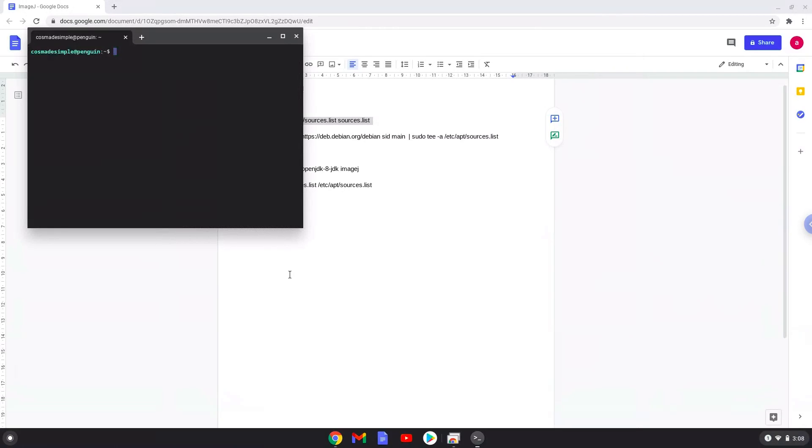Next, we will paste the command into our terminal, either with a two-finger click or by pressing CTRL, SHIFT, and V together. This command will make a copy of your Linux source file.